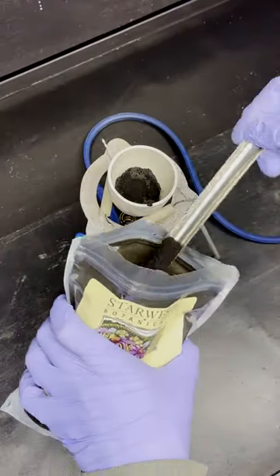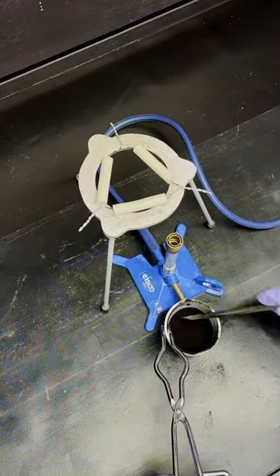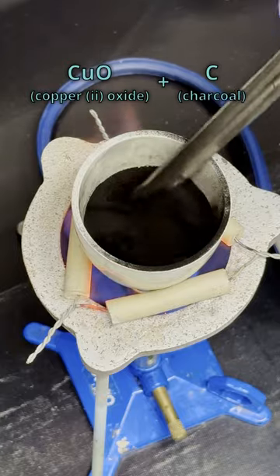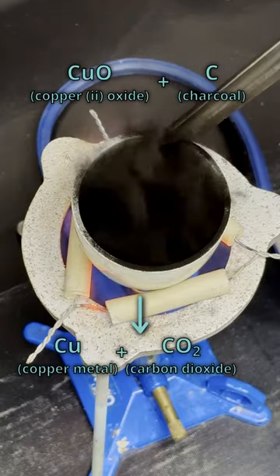Then I can mix it with charcoal — powdered carbon — which is actually more reactive than copper. Because of this, with heat, it rips the oxygen off the copper, blows off its carbon dioxide, and leaves the copper powder behind.